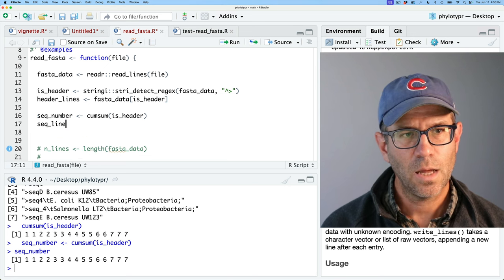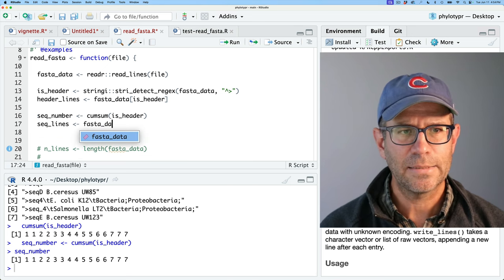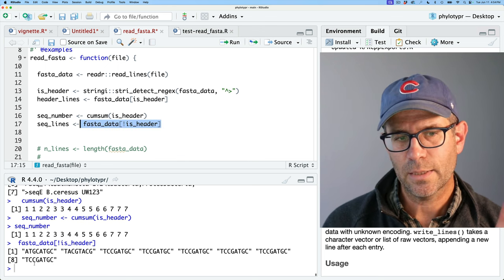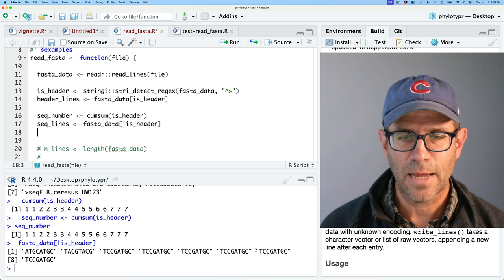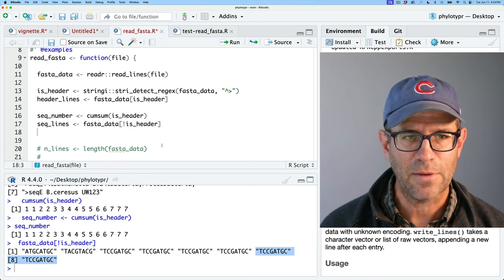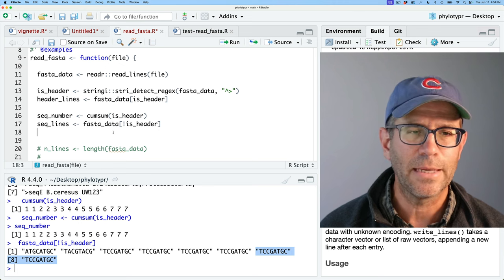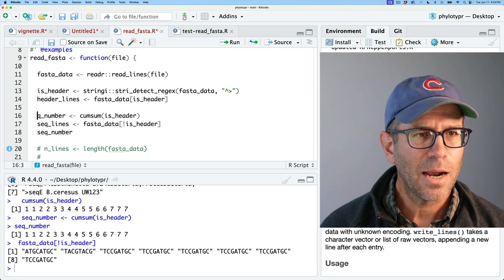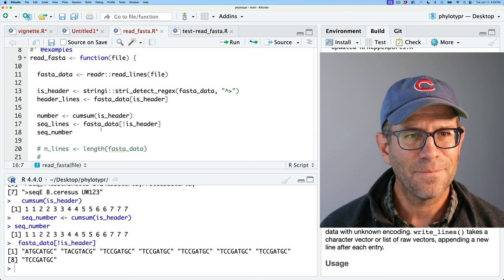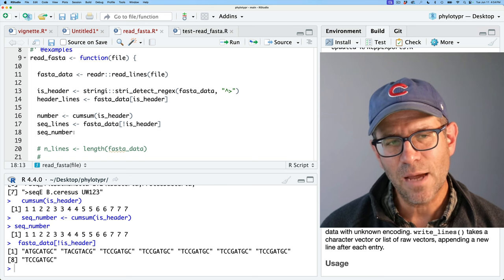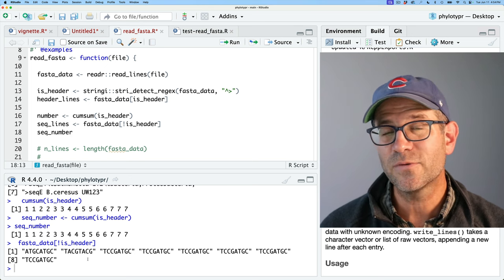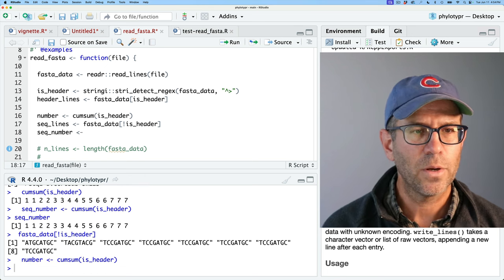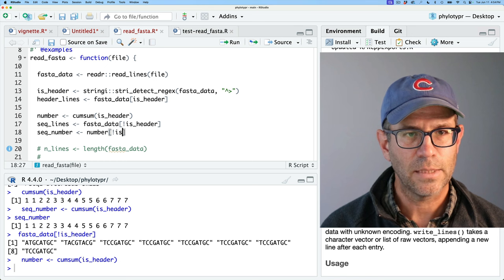Then seq_lines is fasta_data where isHeader is NOT TRUE — that gives us our eight different sequences. Those last two correspond to sequence seven and will ultimately want to be pasted together. And seq_number is number where isHeader is NOT TRUE, which gives us the sequence number that each sequence fragment belongs to.